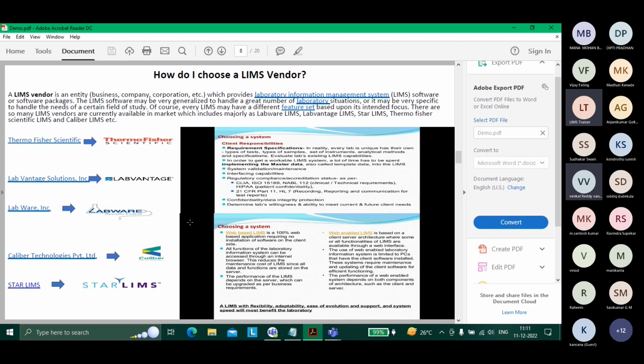Is this language mandatory to learn for these activities? I'm coming to this answer. For performing basic admin activities, you don't need to know the language, but for some heavy automation or integration, preparing scripts, you need to know the language. LabVantage is built on Java, so you need to know Java. Labware is built on Smalltalk, but you don't need to know Smalltalk because Labware uses its own scripting language, which is known as LIMS Basic. So you need to know those scripting languages for automating.